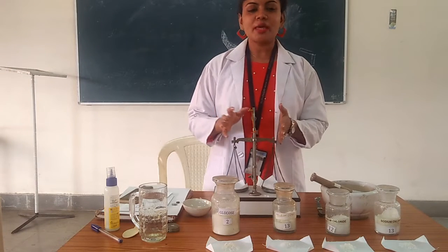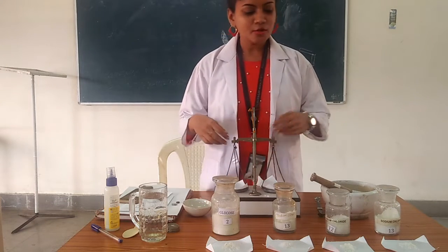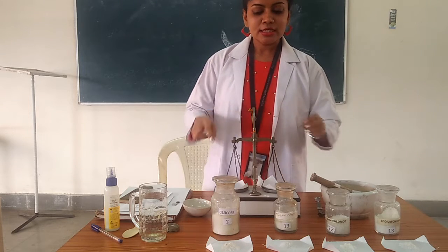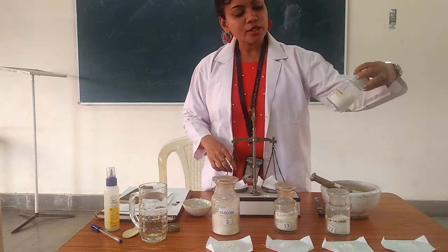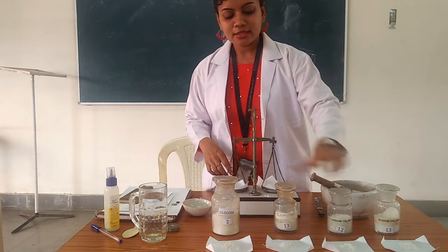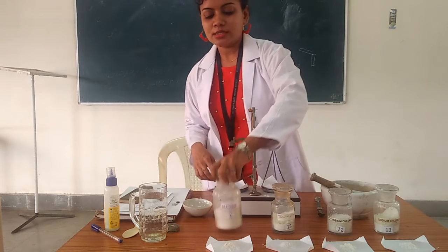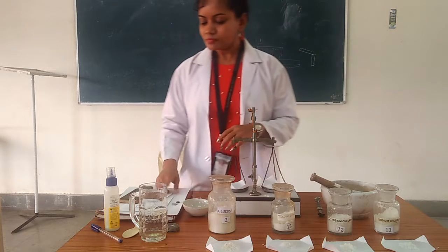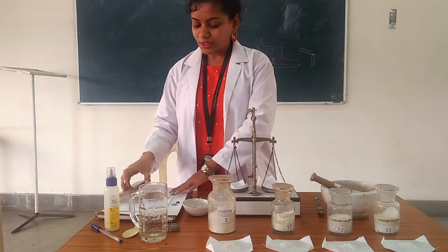Today we are going to make ORS preparations. Here we are going to prepare the WHO approved ORS formulation. These are the main ingredients: sodium chloride, potassium chloride, trisodium citrate, and glucose.